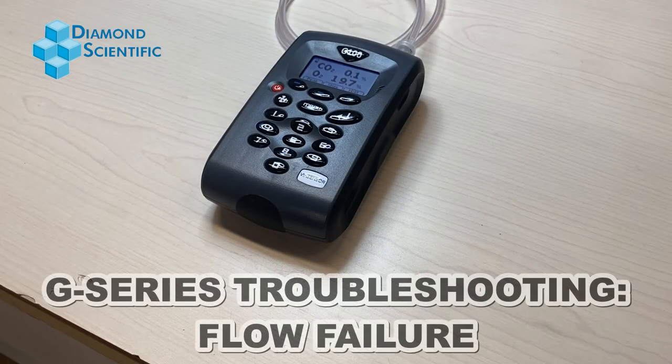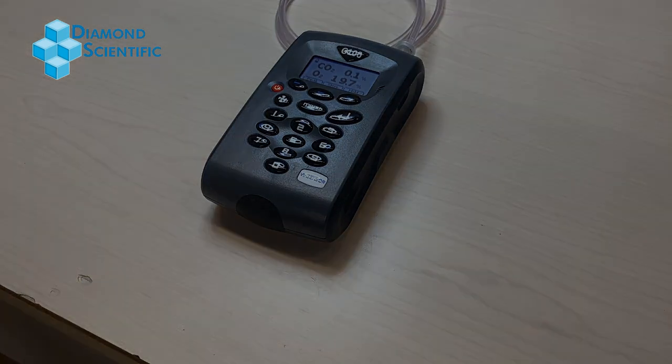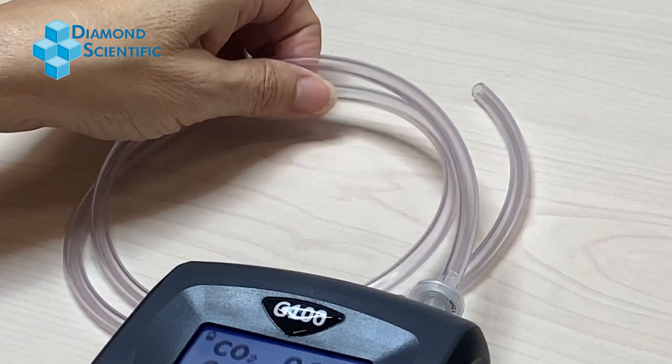Today we are troubleshooting a flow failure event on the Viasensor G100. Before sending in your unit for servicing, you may want to try the following if you are experiencing a flow failure reading. First, make sure the filter and tubing are not clogged with moisture or debris.